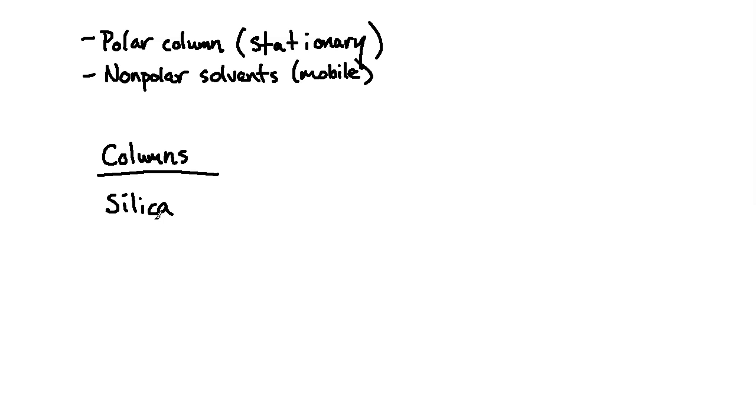One of the things we would utilize was silica columns. It was very, very effective on a larger scale, larger than HPLC, separating out hundreds of milligrams to grams of material at a time with this benchtop type of process.